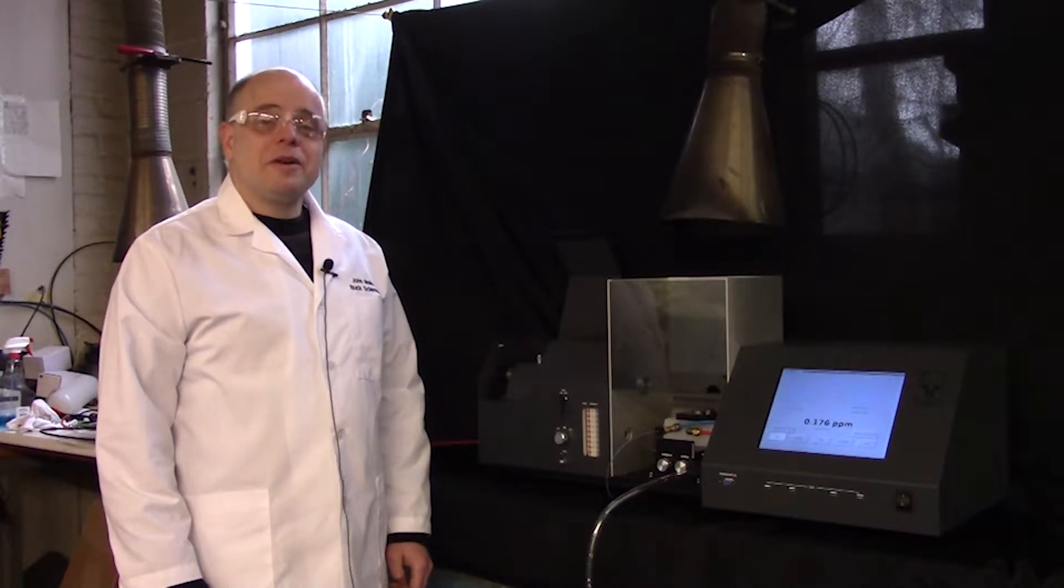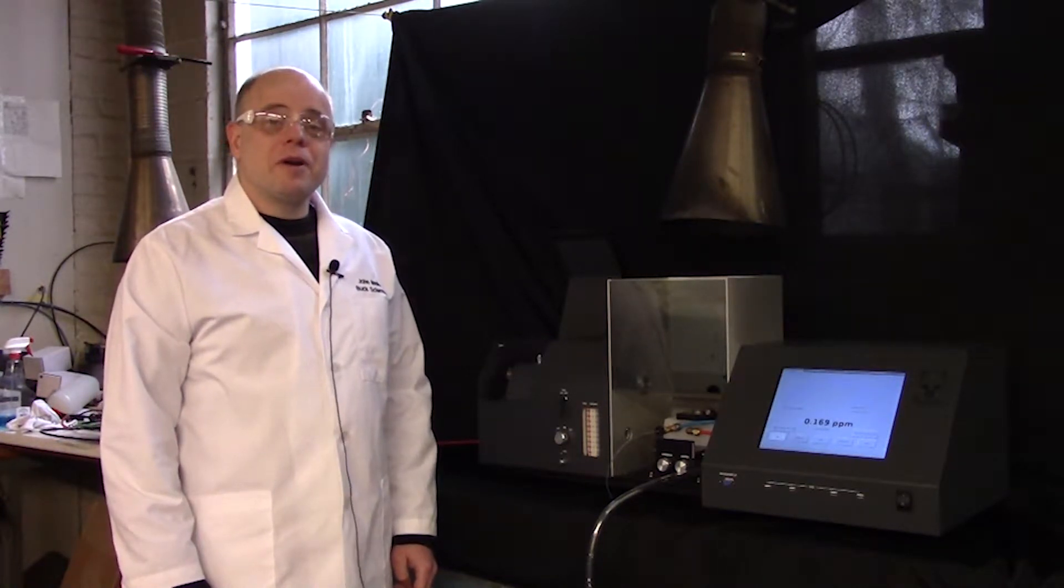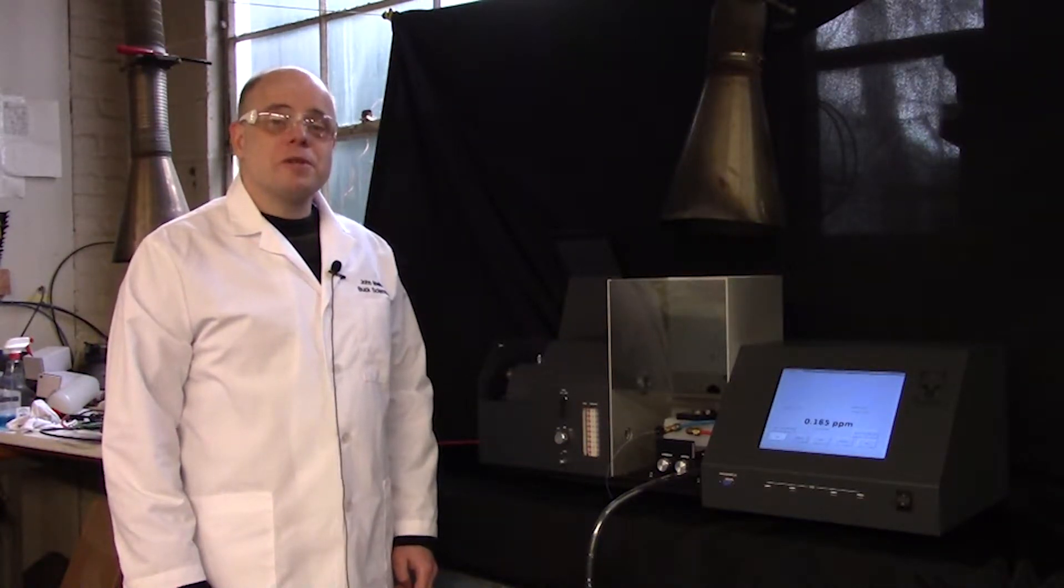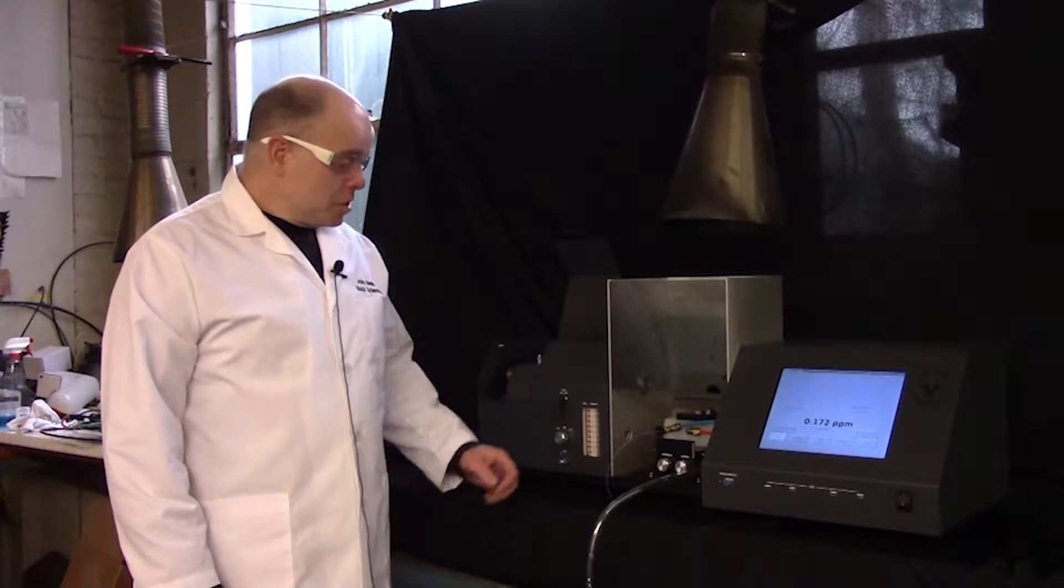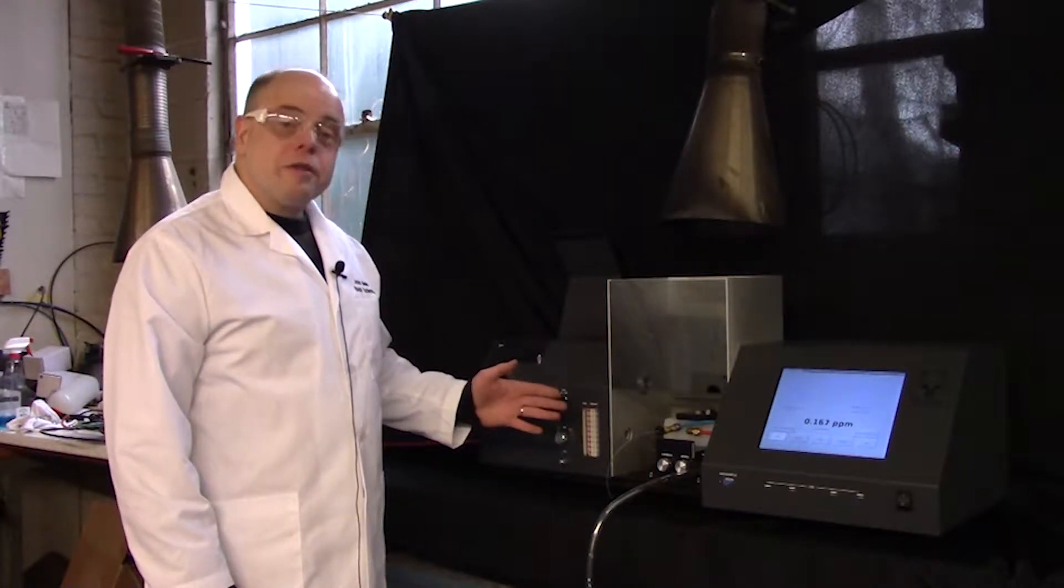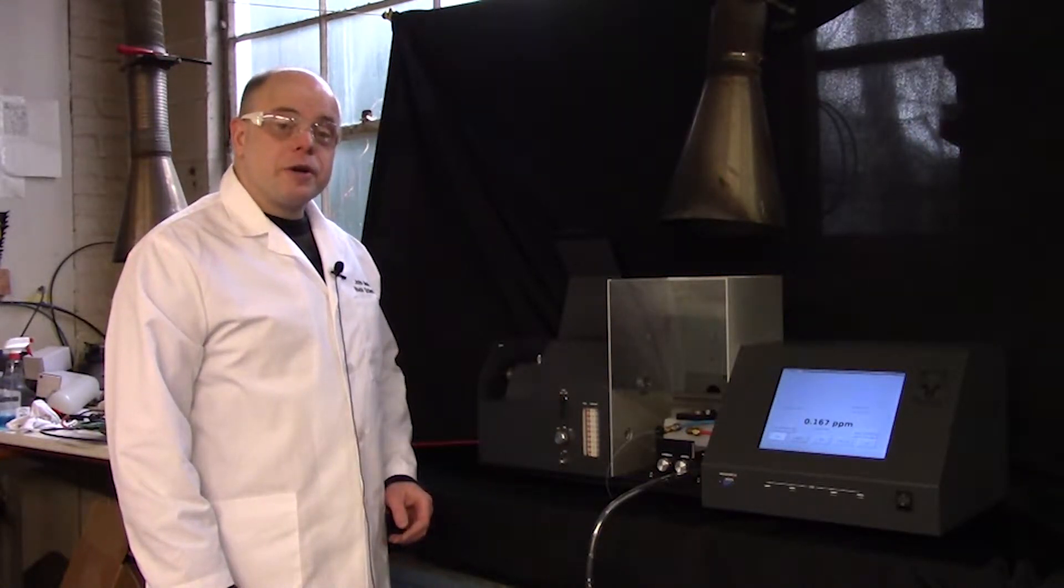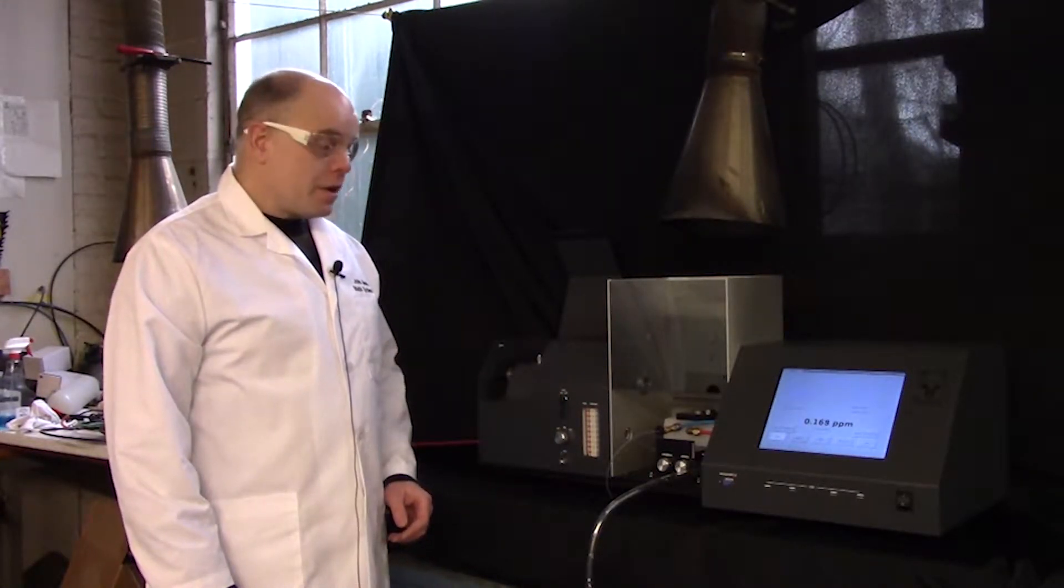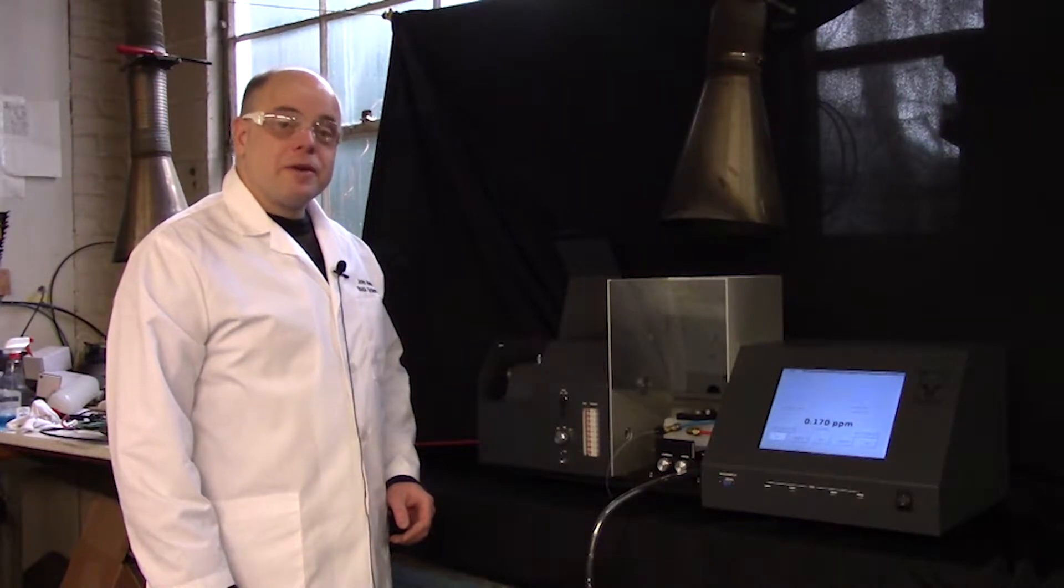Hi, I'm John Meller, Production Manager for the Buck Atomic Absorption Department. Here I'll be demonstrating the use of the Model 230 AA Spectrophotometer.